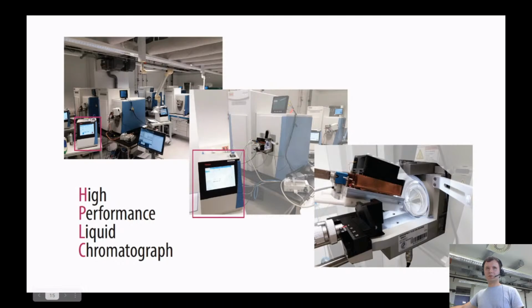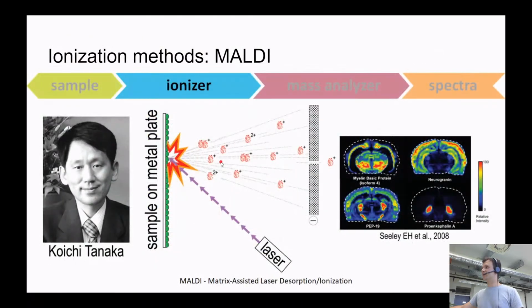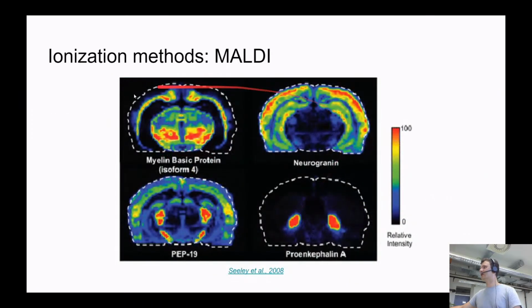But while somebody may be typing, I will just summarize again. Two methods exist for ionizing. MALDI uses a laser as an ionization source. It's basically adding energy to the sample, with evaporation and ionization happening simultaneously. MALDI is not used a lot currently in very common proteomics, when you would like to measure 10,000 proteins, but it's used a lot in tissue-based imaging proteomics.